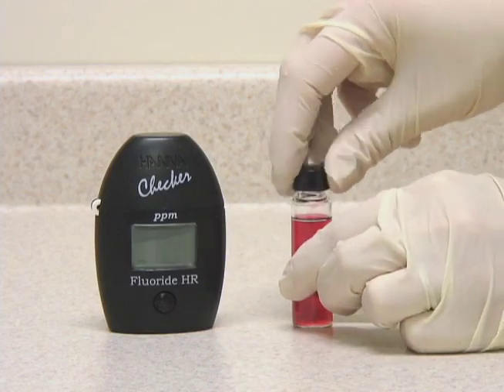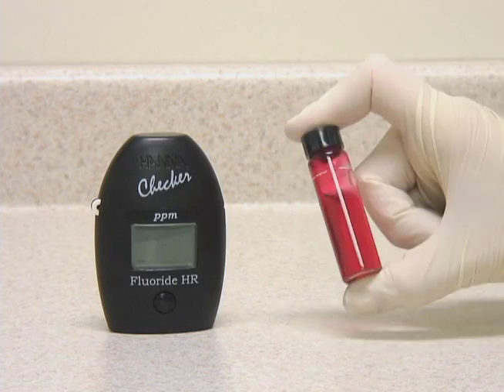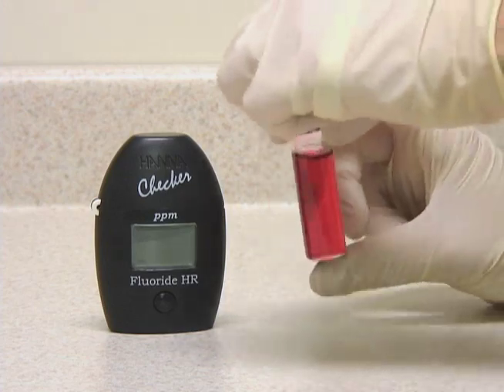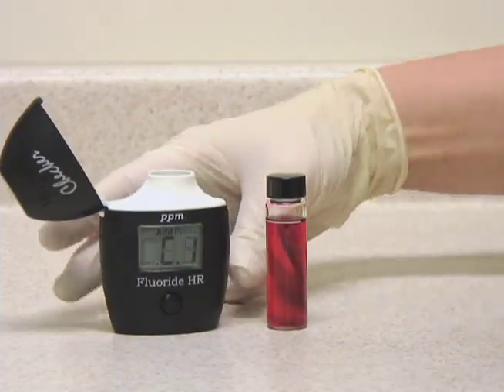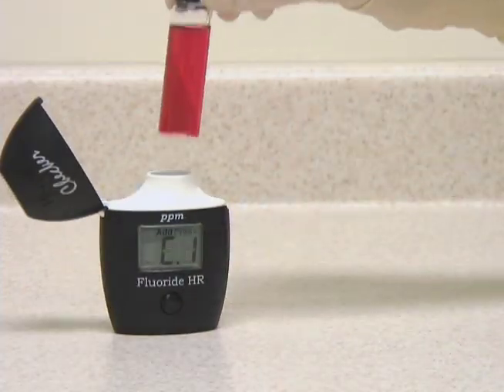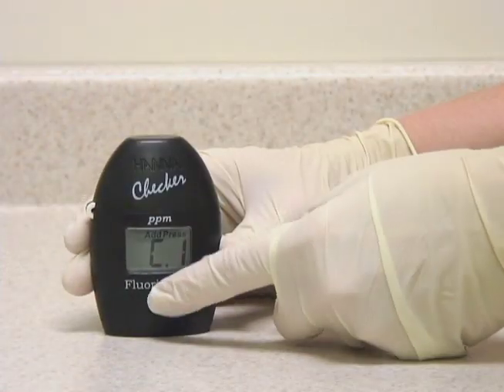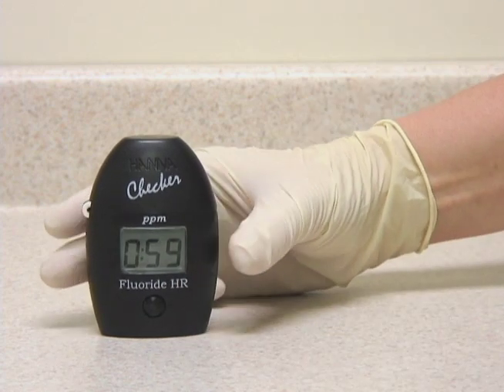Now we'll replace the cap and invert a few times to mix. Then we'll press and hold the button to activate a one-minute countdown.